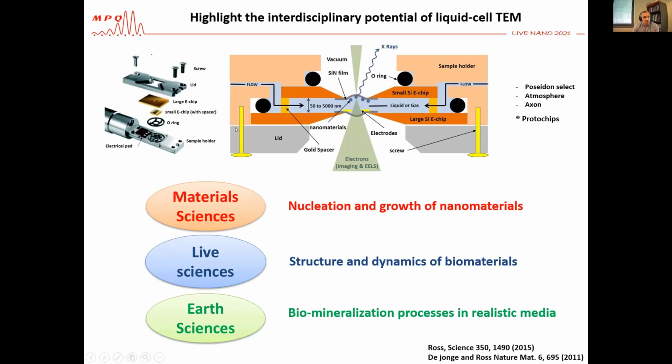So today I will be only talking about liquid cell TEM, so all the experiments that we do in liquids, and I'll show you what we can do with this technique to study the nucleation and growth of nanomaterials, to study the structure and dynamics of biomaterials, and also how we can study biomineralization processes in realistic media.